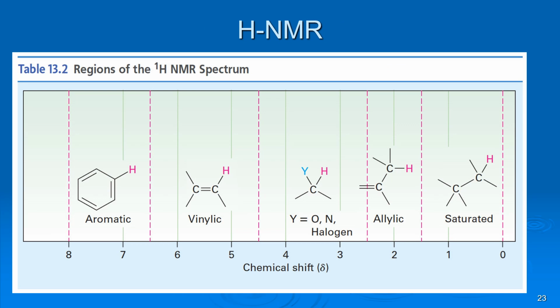All right, so again, this is similar to the last one, dividing the spectrum into its regions. Like I said, hydrogens on saturated carbons tend to be around 1 to 1.5. Allylic means the hydrogen is not on a carbon that's double bonded, but near a carbon that's double bonded. It could be a CC double bond, or a CO double bond, or a CN, or whatever. But a hydrogen one carbon away from a double bond tends to be about 1.5 to 2.5.